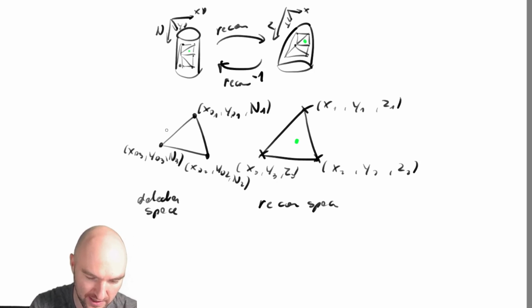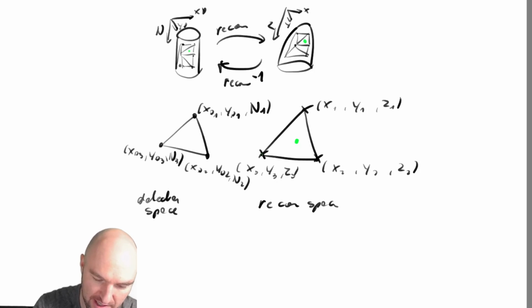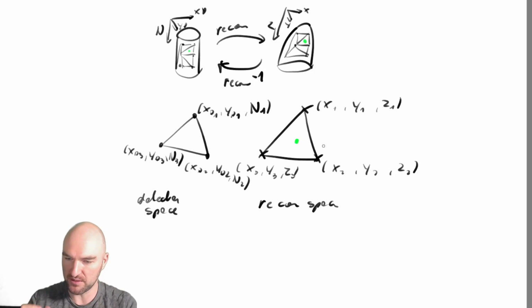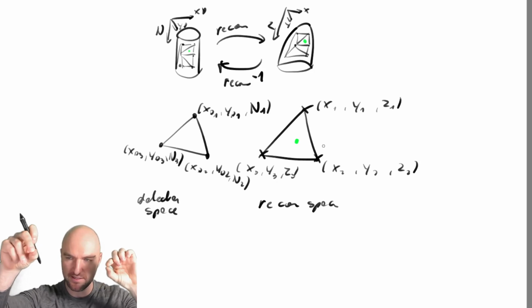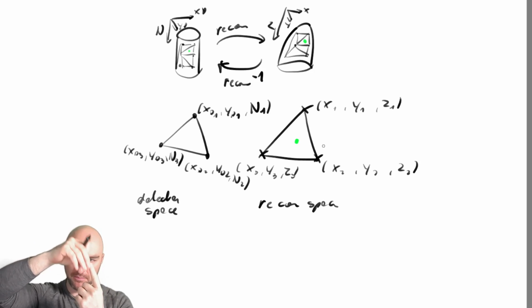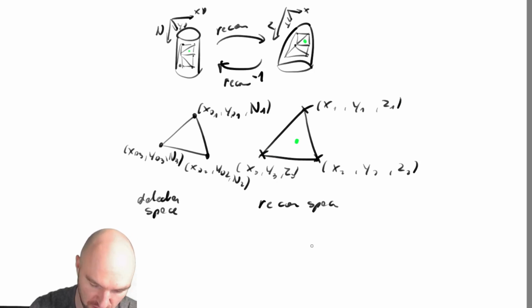And so how do I get the coordinates across here? Well, by using barycentric coordinates. And barycentric coordinates means essentially you give a weight to each of those vertices, so that if you would hold a triangle and the triangle itself doesn't have any mass, and you would put weights at the corner of each triangle, the point that you're holding it at would be the center of gravity, the barycenter. And so in this case, of course, the boundary condition is for barycentric coordinates.